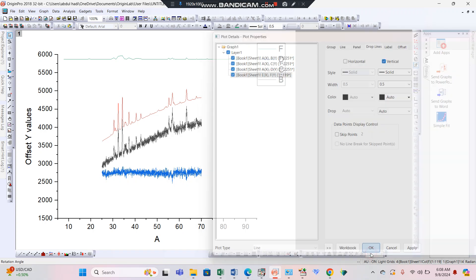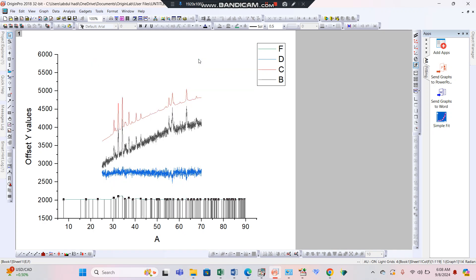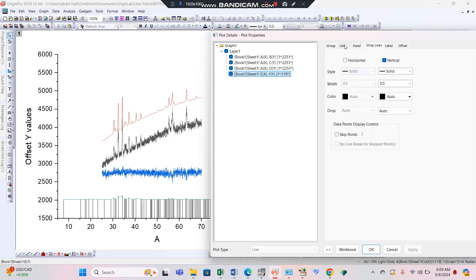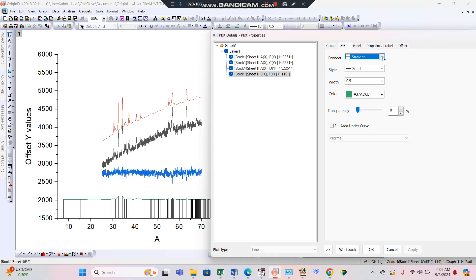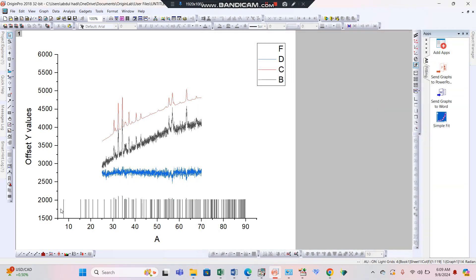We can move or change the position of this graph from upper to bottom. Here you can see the JCPD card lines. We do not need the connecting line visible at the upper level of these lines, so double-click this line and select no line. This way it becomes only vertical lines representing the peak positions of the JCPD card.